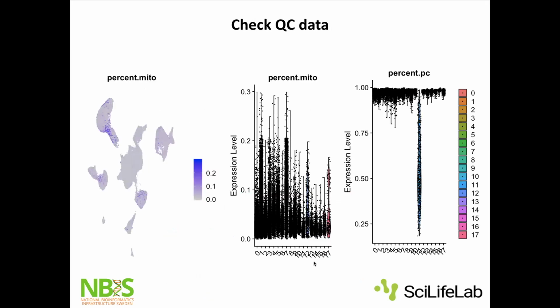And as I said, always do your clustering. We talked about looking at QC on the UMAP, but also look at QC on your clusters. You might see something like this. Like here I have one cluster with really low proportion protein coding. There is something fishy with this cluster. Maybe I need to go back and look at my QC and filter it out.